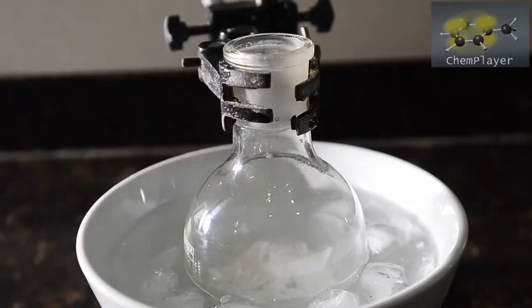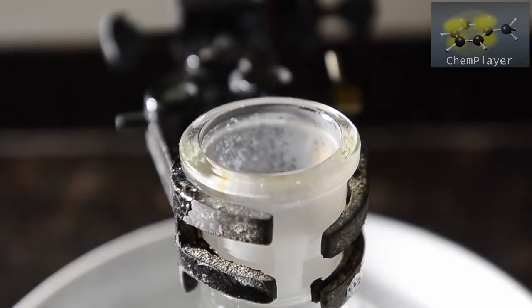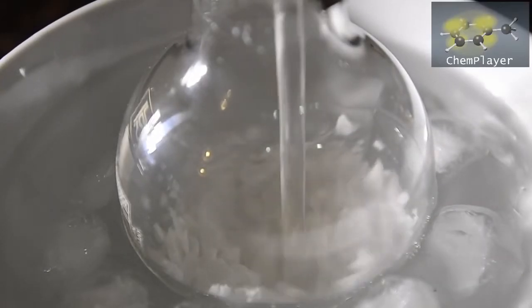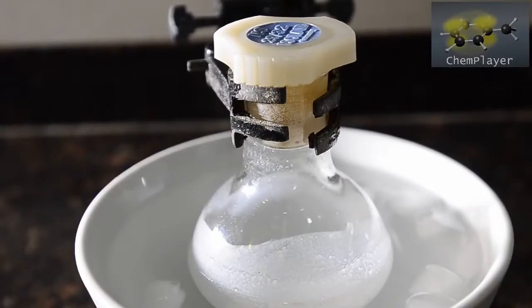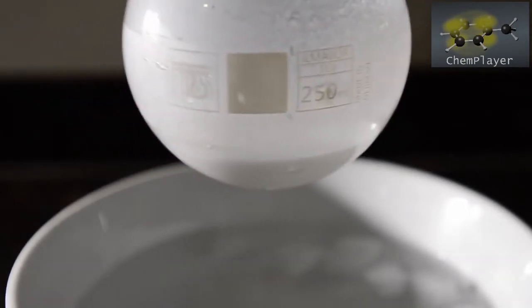We're going to need to use some strong cooling for this, so we place the flask in an ice bath, and we'll use the glass rod to mix the contents around. So we continue addition of the propionyl chloride in small portions, and mix around after each, allowing the mixture to cool. After a while the mixture forms a fairly liquid slurry. On complete addition we left the flask for 30 minutes and we noticed that the lumps of sodium propionate broke down, forming a fine white powder. The mixture is surprisingly liquid.